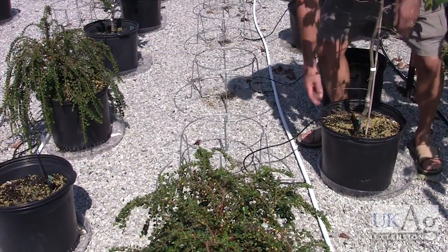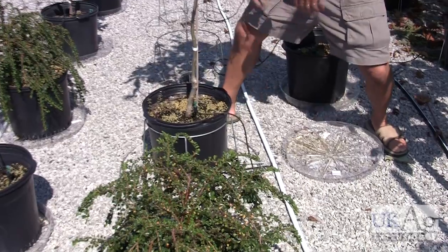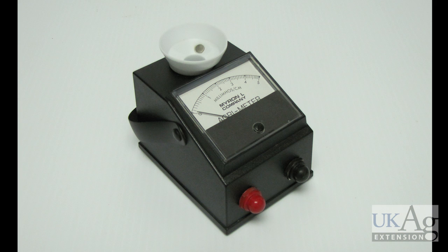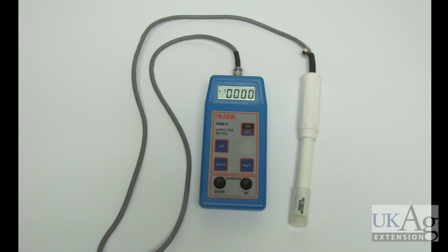Now it's time to take your readings. Remove the container from the tray to allow access to your collected leachate. There are many different meters available to use for these measurements. The Myron-L AG5 Agra meter is an example of a simple EC meter — the user simply pours leachate into the cup until both probes are covered. In this demonstration, we'll be using the Hanna Instruments HI-9811 pH-EC-TDS meter, which uses a single probe to measure pH and electrical conductivity.